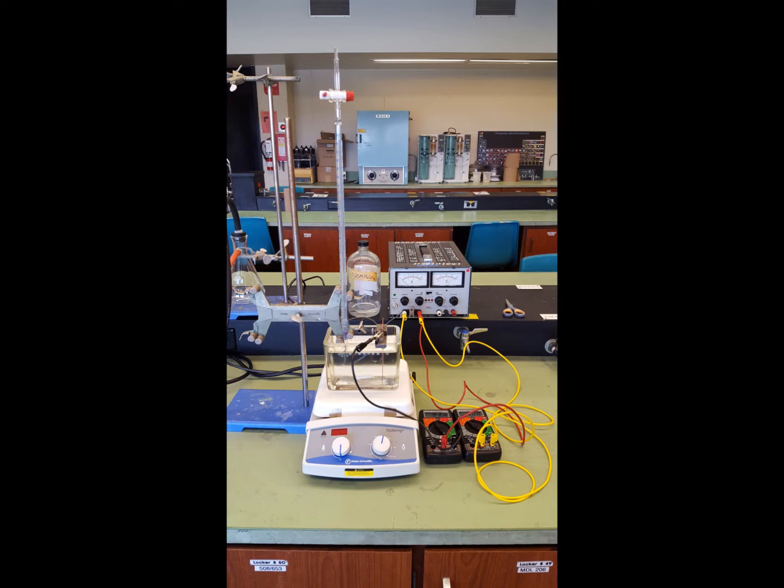You will notice that by weighing the plate at the end of the experiment when it's dried, there will be a mass loss, and that mass loss represents the mass of copper that's been dissolved, basically oxidized and gone into solution. The negative terminal of the power supply is connected, you can see, by a gray wire.